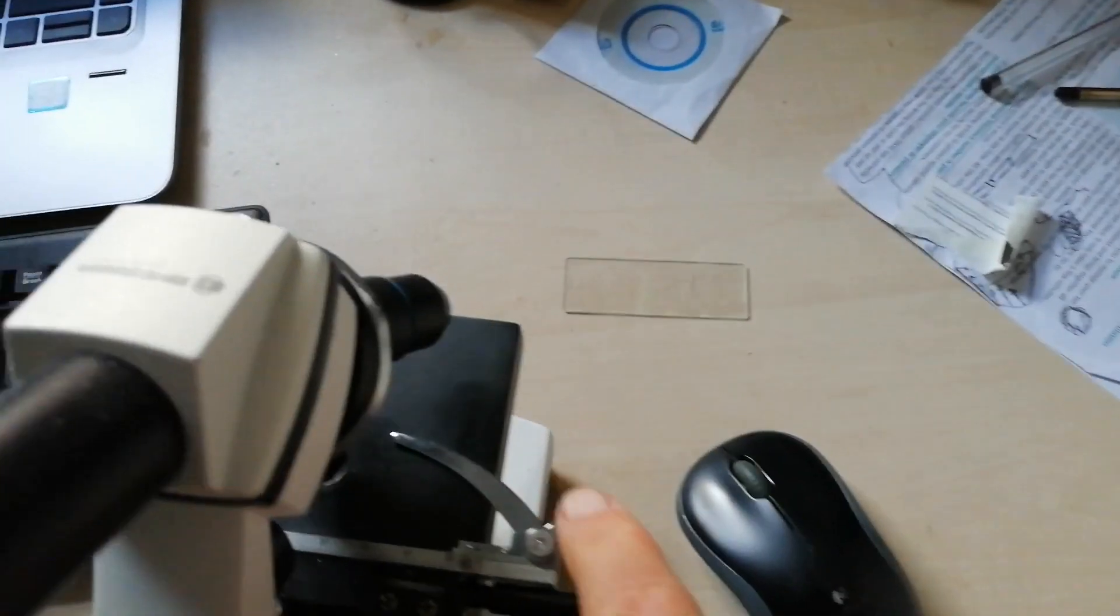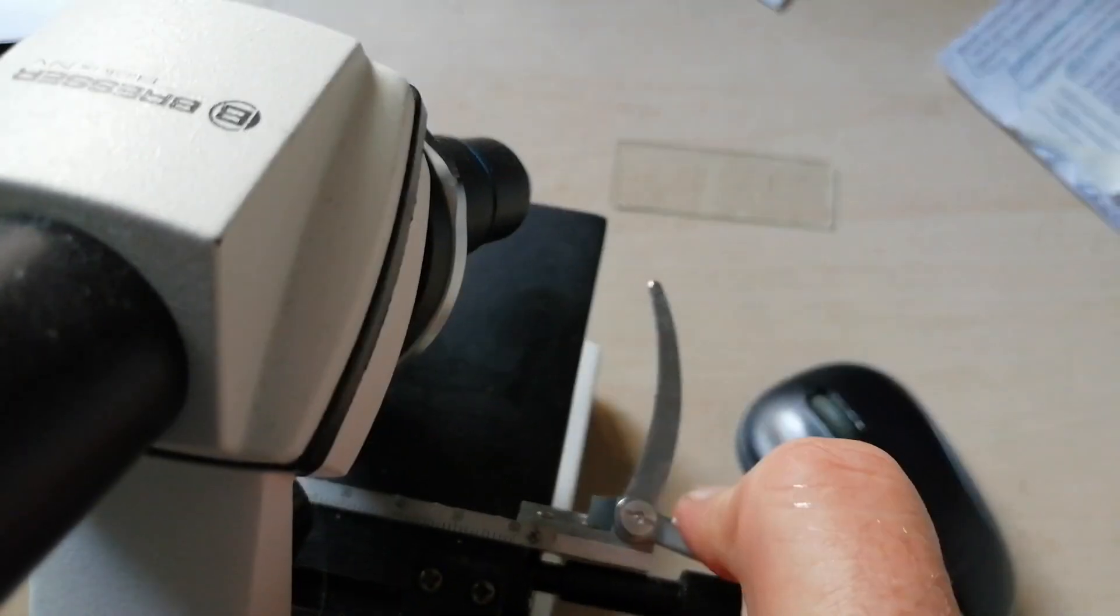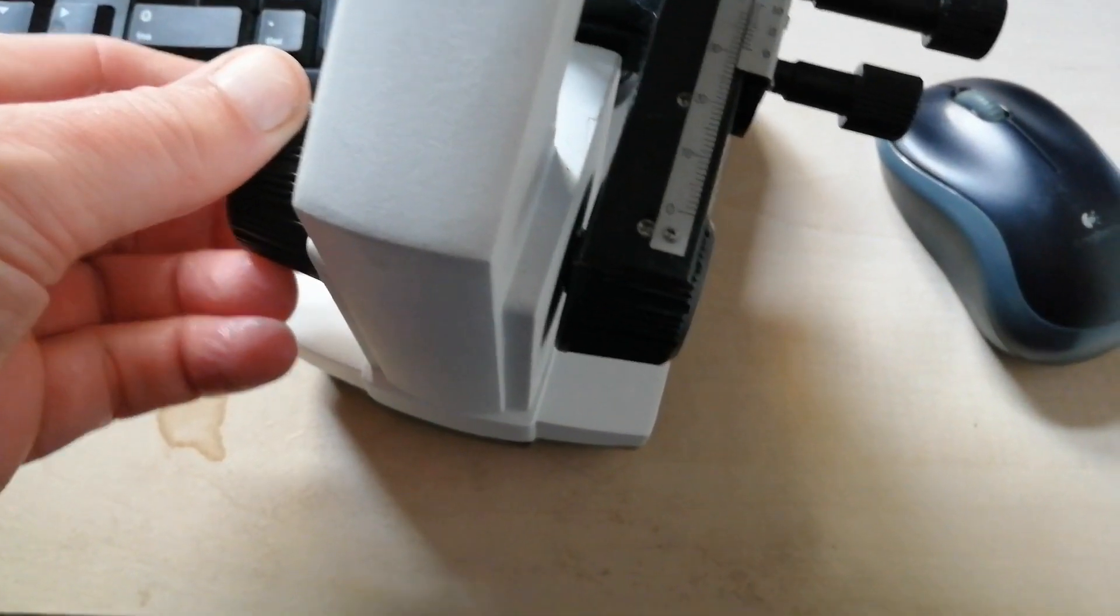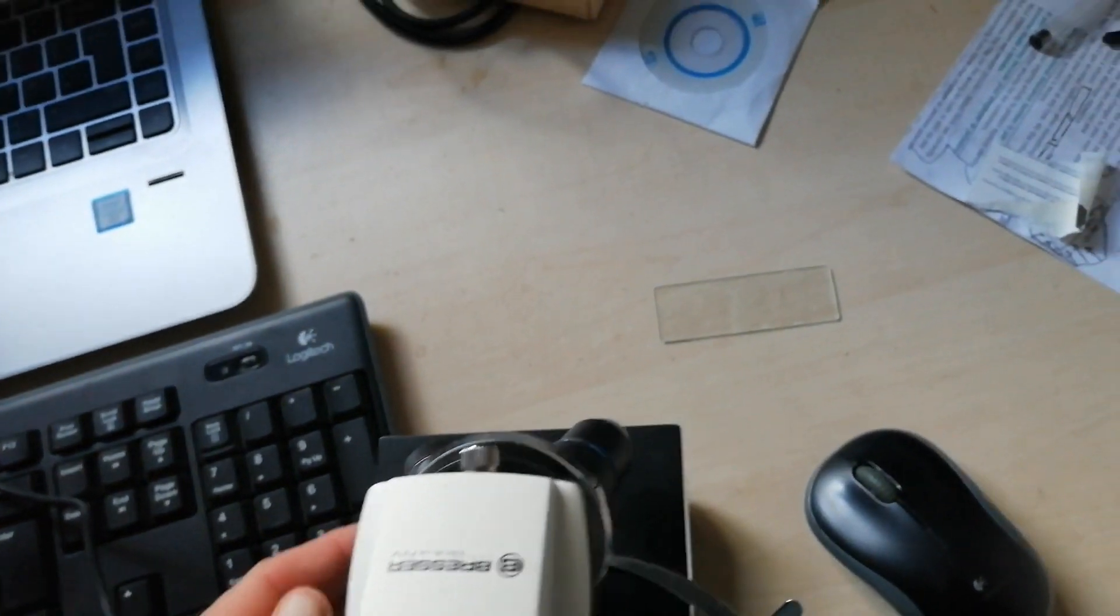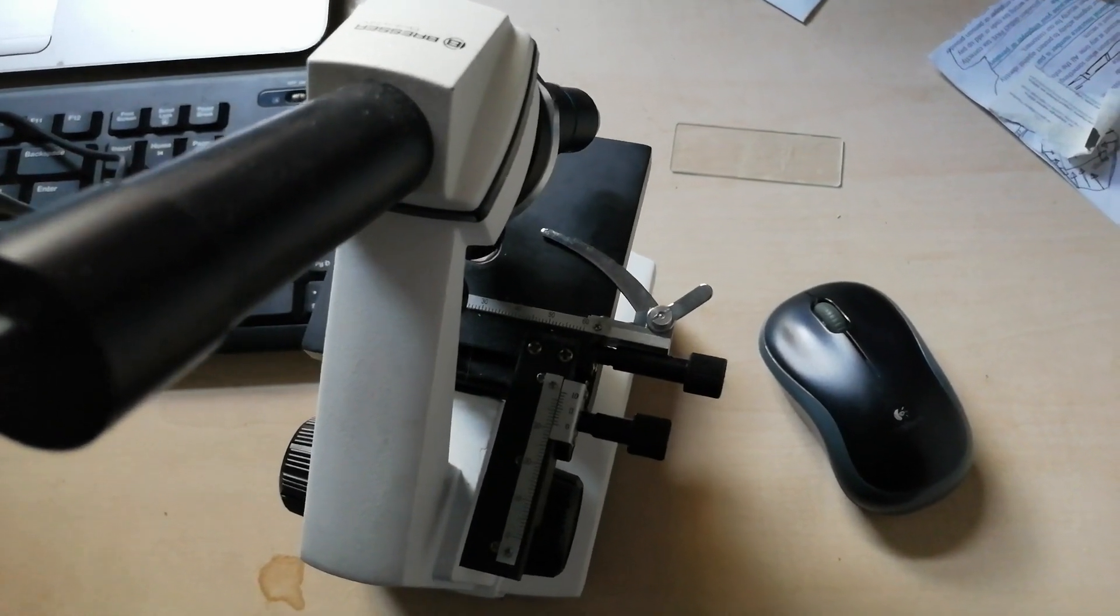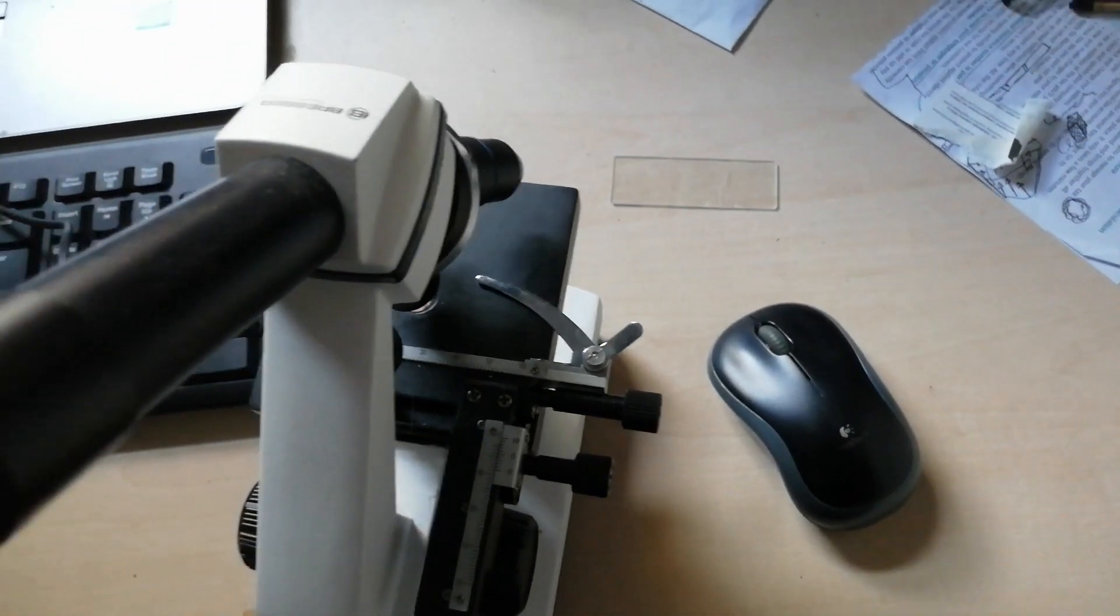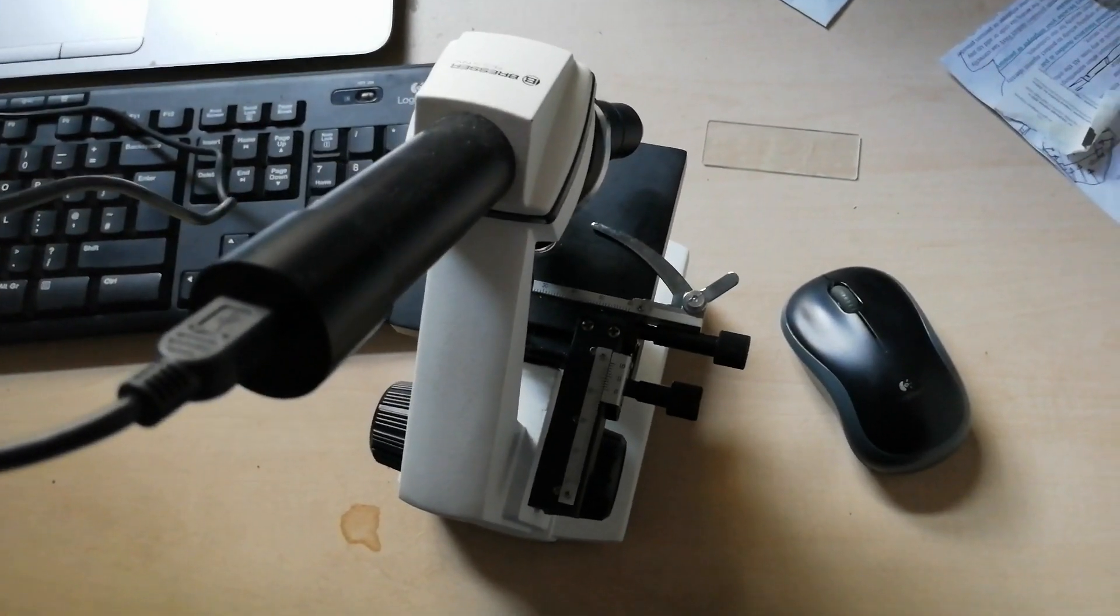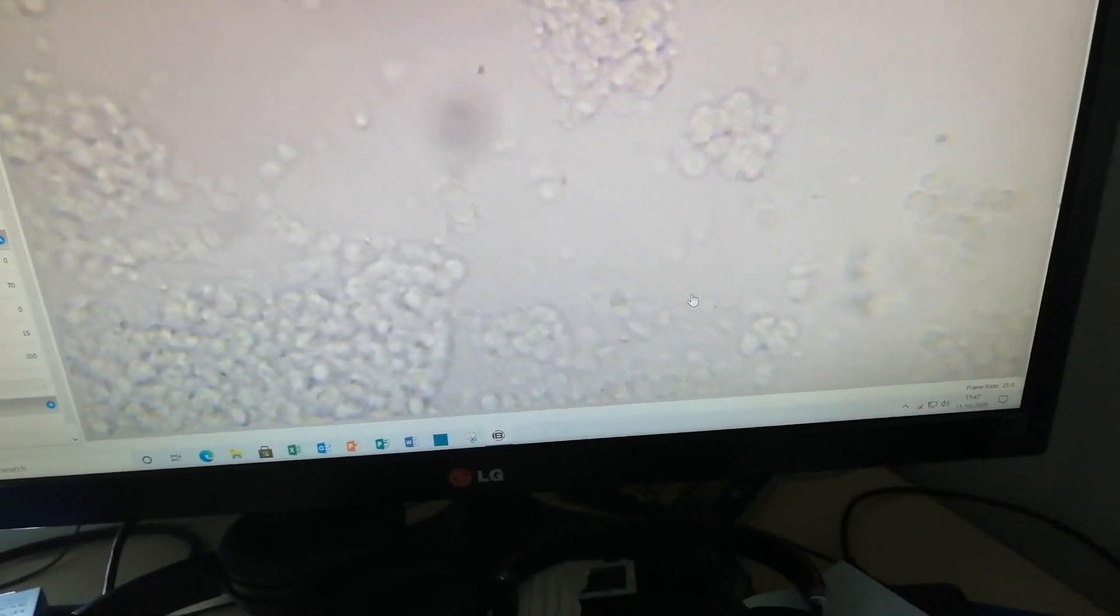So this is just a case of you put the slides in there, and then moving these back and forth, up and down. Then you get the zoom and the focus.